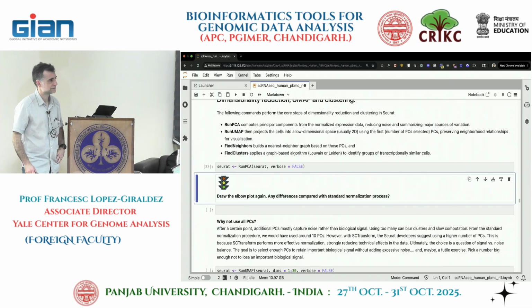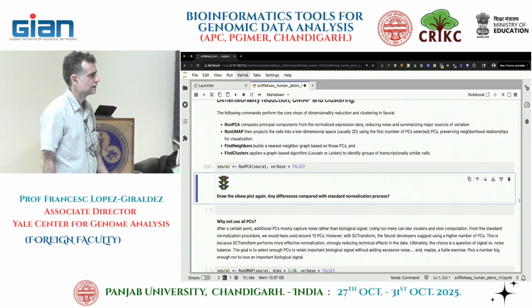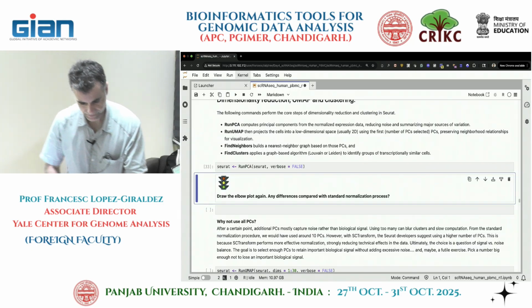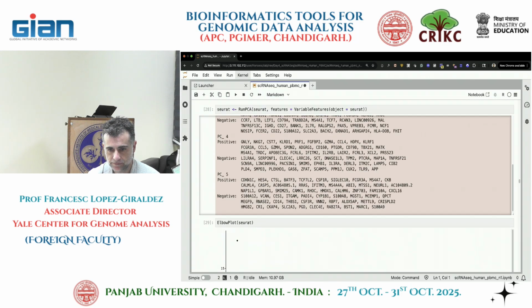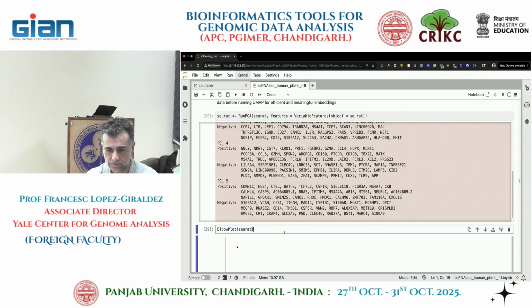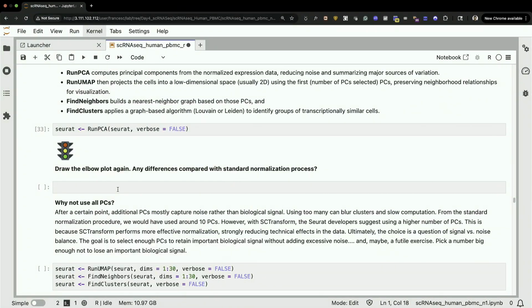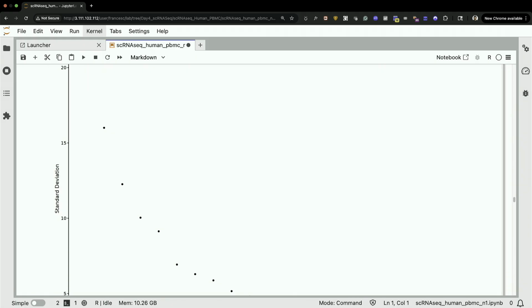It's on? Okay, good. So it's running faster than previously? And here is the estimation between two of the elbow plots, yeah. Okay, good. Did it finish for everybody? No?